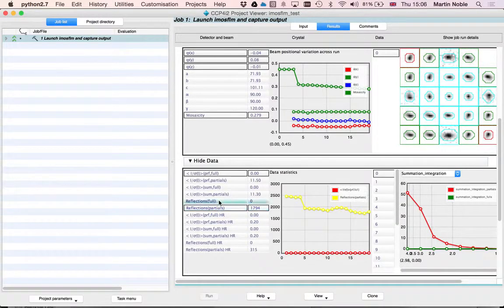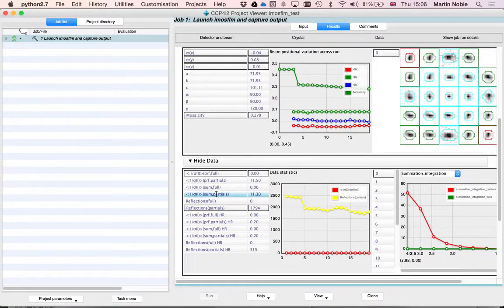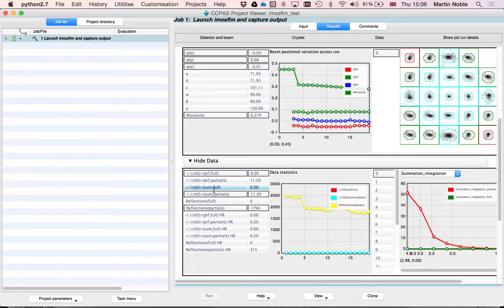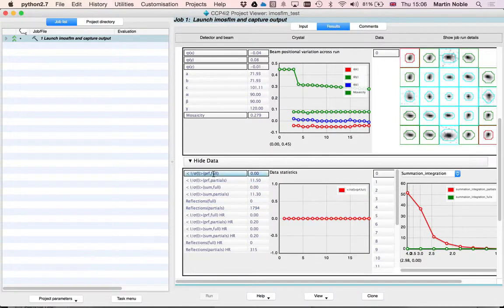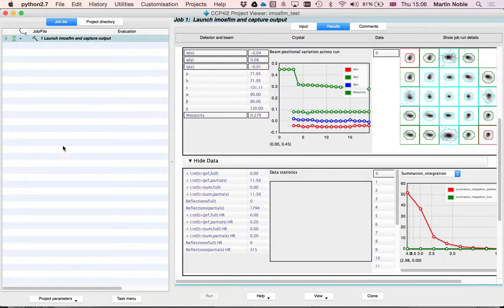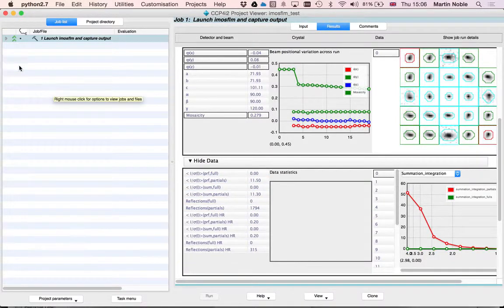And you can click your way through this and see how your processing went, turning lines on and off, very much as you can in the iMozFilm interface.